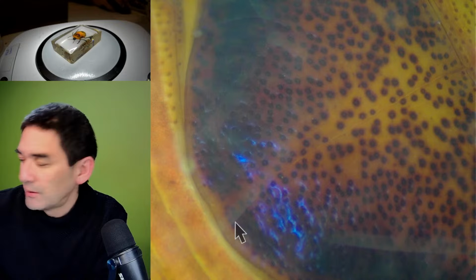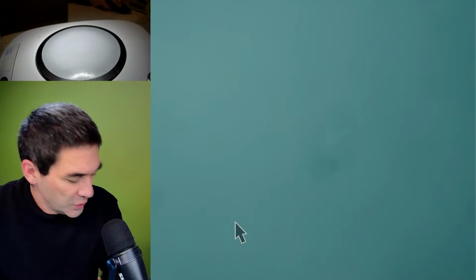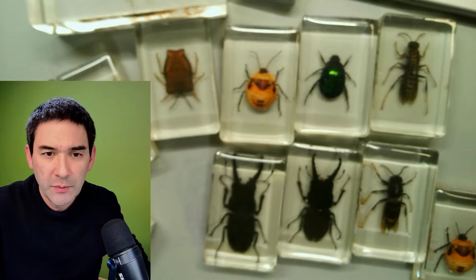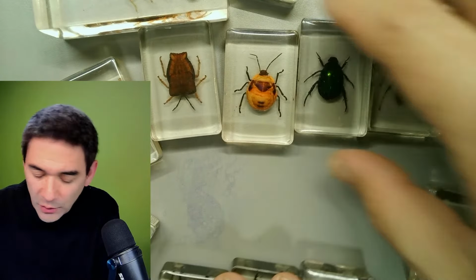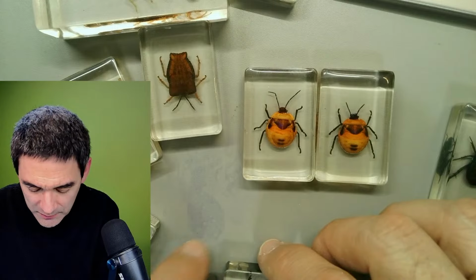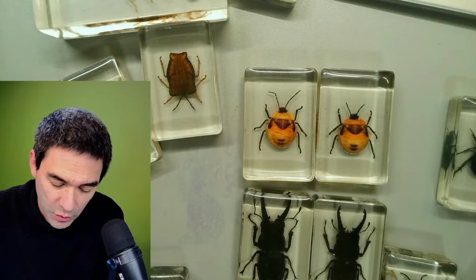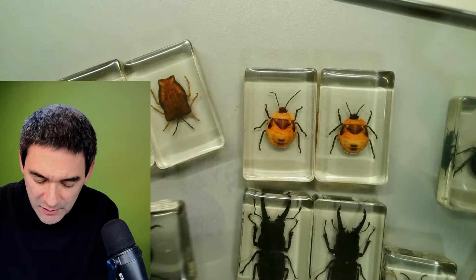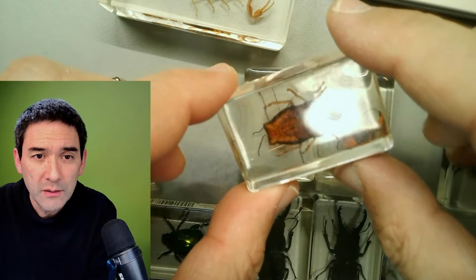Yes, so let's have a look at a few others, and then there's actually one problem that I also want to show you with older ones. Quickly. I don't know, but look, some of them are always repeating a little bit. I assume if you are a company that does that, you're probably going to breed those animals. And this one over here seems to be a little bit transparent as well. So let's have a look here.